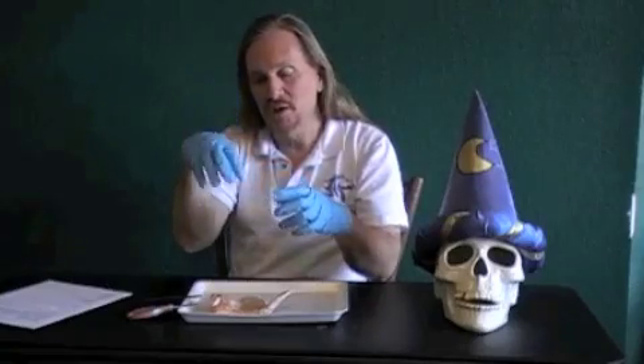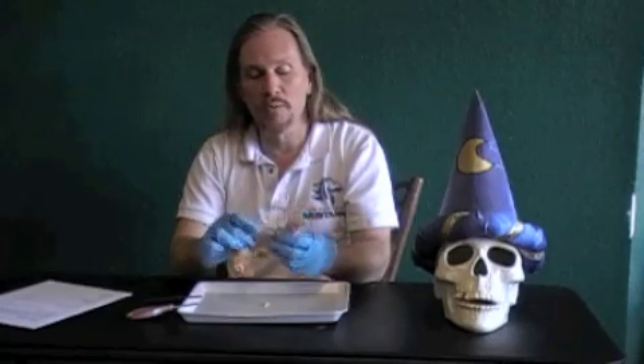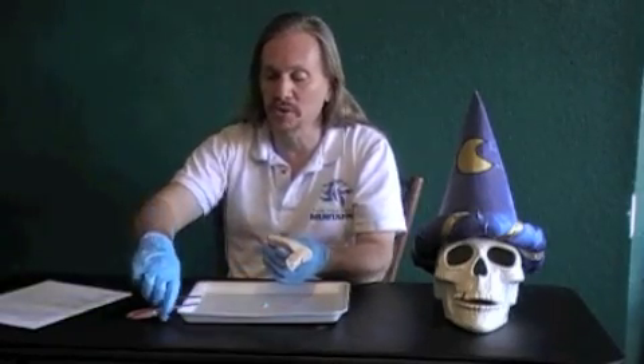Welcome to the lab on muscle structure. For this lab we are going to be using a chicken wing to show you how the muscles work. A chicken wing is very analogous to your arm where you've got the upper arm, the lower arm, and your hand - the same three parts are part of the chicken wing. So we can look at all those different muscles as we go through this.